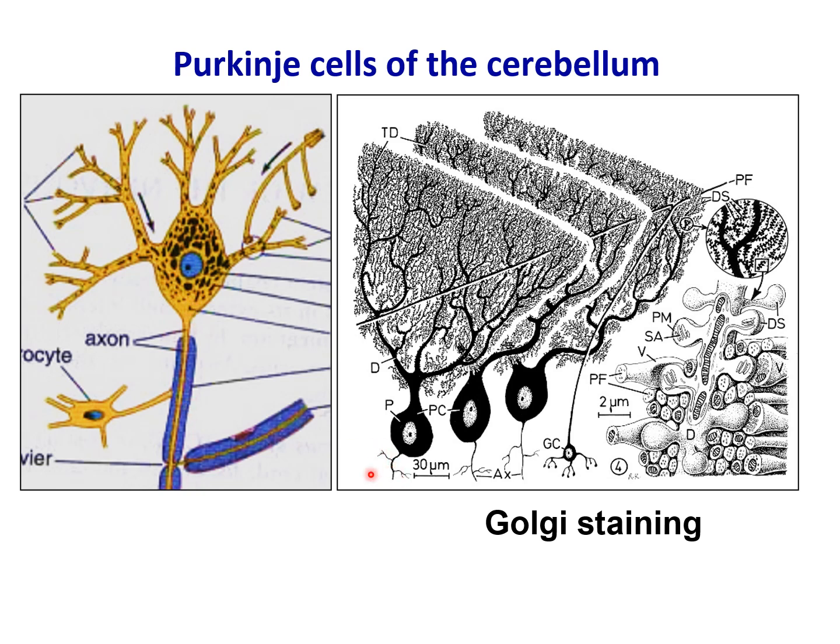The axons carry these impulses away from the Purkinje cells, and this is an oligodendrocyte which myelinates the axons. This is in Golgi staining, the drawing of a dendritic tree of the Purkinje neurons.